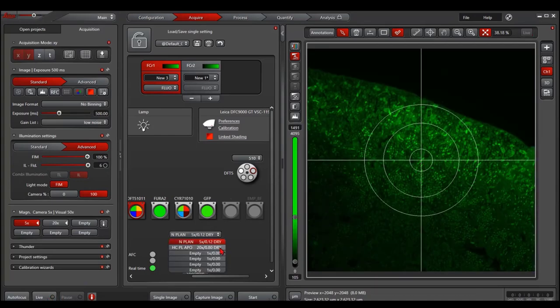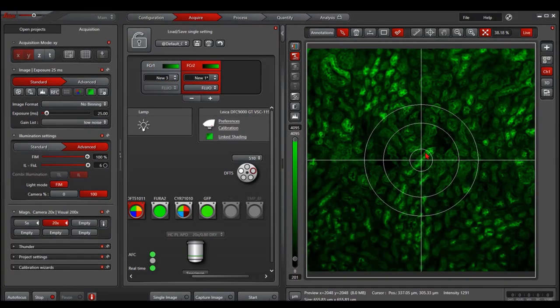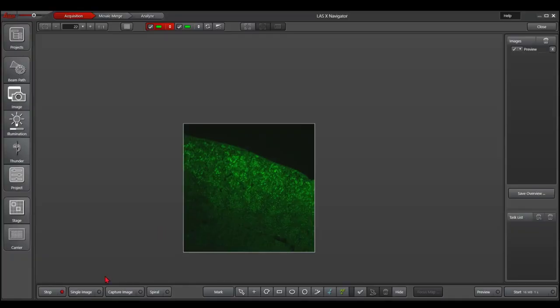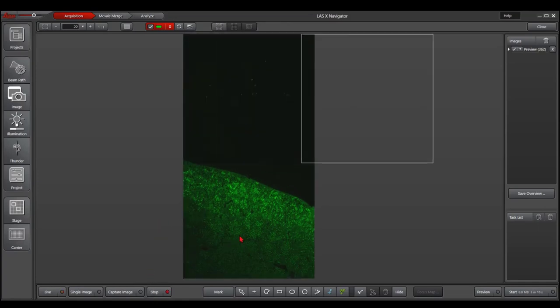Then I switch to 20x. You will see the same object. It's in the center and in focus. This is really useful when you use the navigator. You can use the lower magnification to do the spiral.